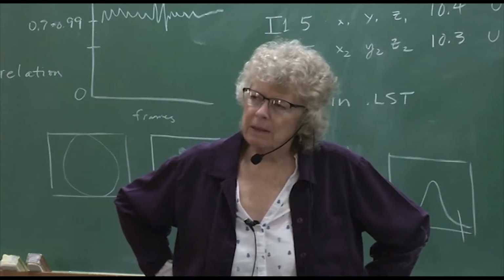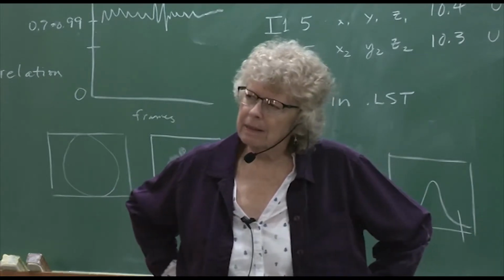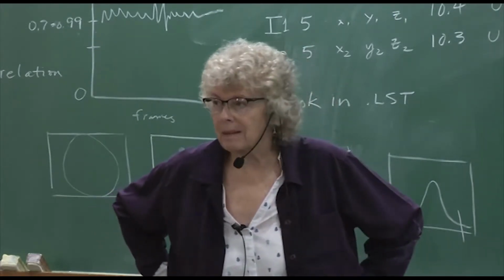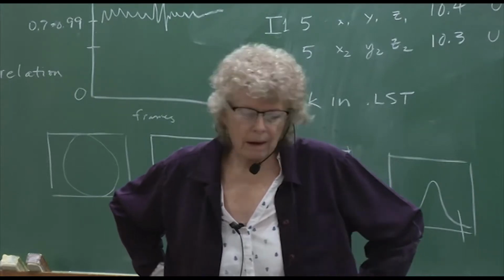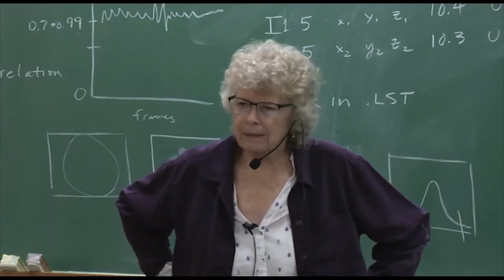The R factors increase? No, not if you've done it right. They shouldn't increase. They usually decrease. Yeah, because by doing this, you're taking into account all of the scattering, so it should decrease. It should, yeah. What causes the R to increase is just an increase in the number of parameters, or something that's wrong.